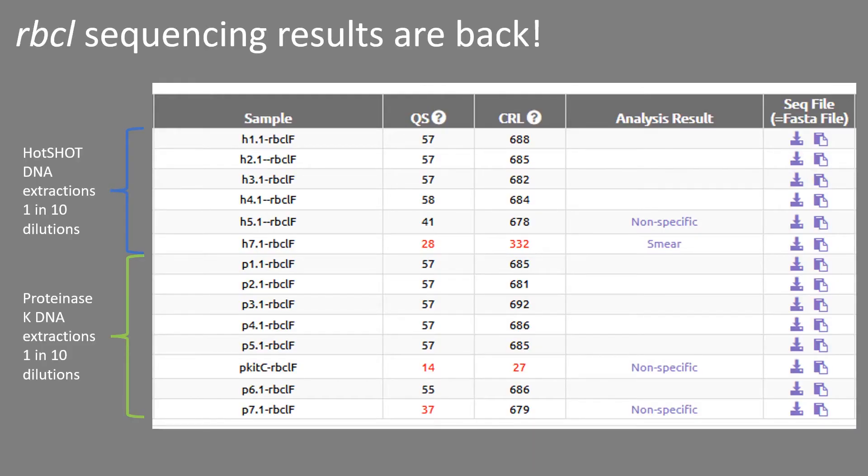I sent the amplicons off in two batches to be sequenced: the first batch using the RBCL primers and the second batch using the MATK primers, just to keep everything separate and avoid confusion. So if you've seen any of our previous video blogs about sequencing, you'll recognise this — this is what the results look like when they come back from the sequencing facility. Briefly: H is for DNA extractions done using the Hotshot extraction kit, P is for the Proteinase K extraction kit. The .1 refers to the 1-in-10 dilutions, which were far more successful at amplifying than the concentrated DNA extractions. Black in the QS column means it worked; red means there was a problem. Overall it's looking pretty good, and I will come back to the red ones later.